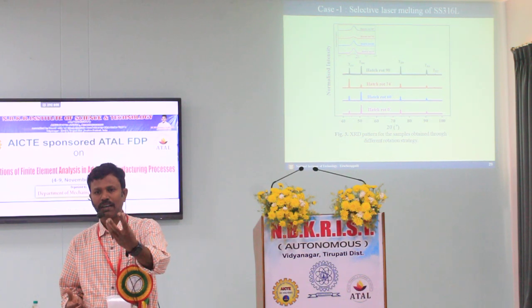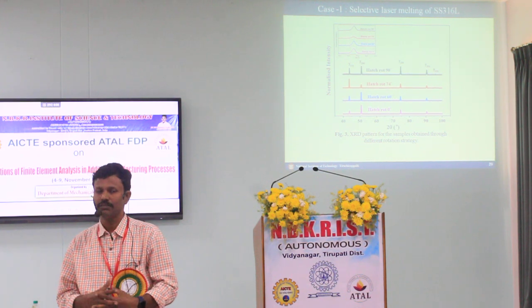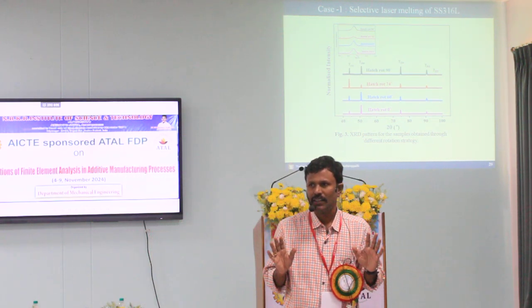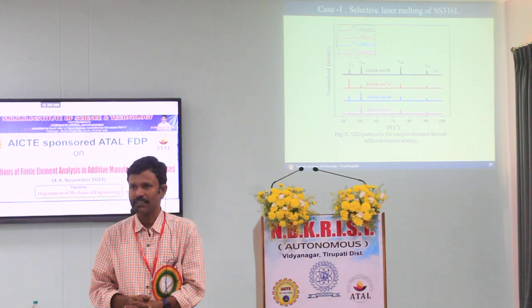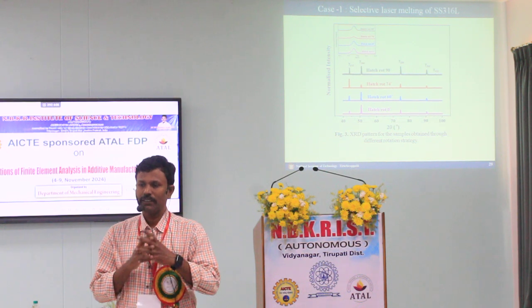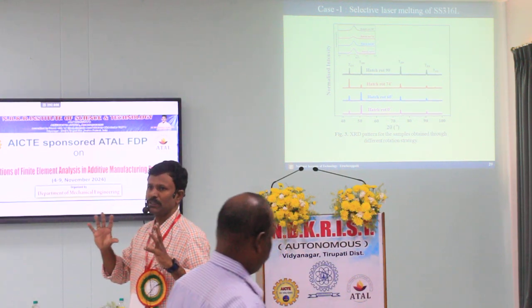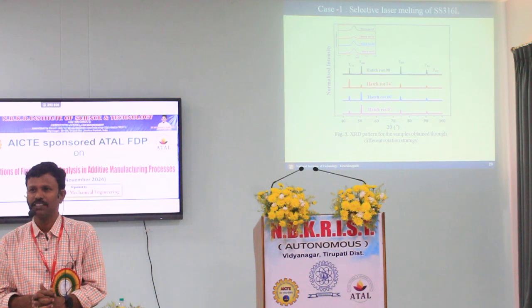It has melted down and solidified. During the solidification process, what kind of phases has it formed? Please understand, XRD is not a chemical analysis tool. XRD is phase analysis. I'll give you a small example. I have taken an aluminum alloy with silicon carbide reinforcement. Mechanically, many people will use this as a composite, a matrix composite: aluminum matrix with silicon carbide particle reinforcement.